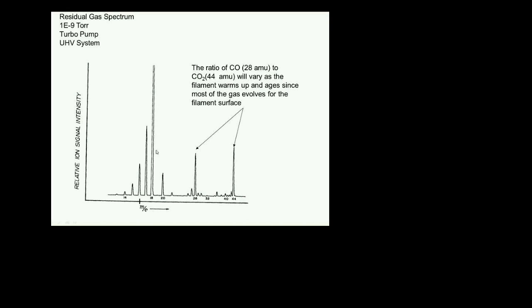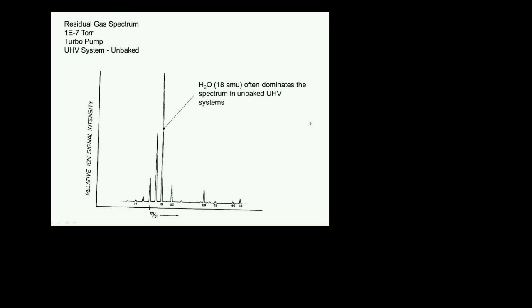So in this case, changing the level of water in the ionizer, even though it should only change the water levels, also affects the levels of carbon monoxide and carbon dioxide. So always keep your chemistry mind open, okay? Because these things happen all the time.